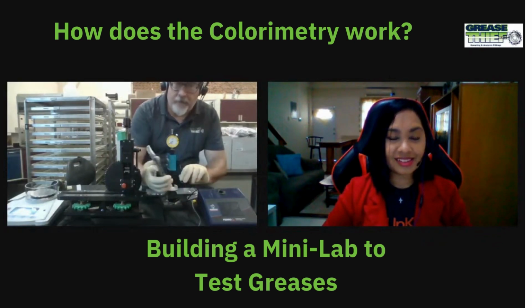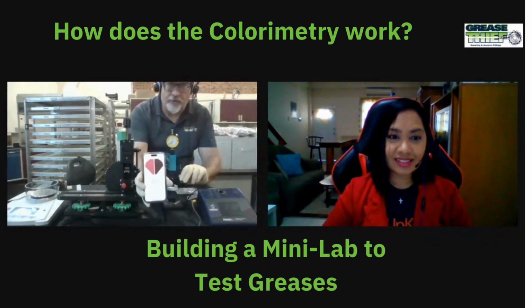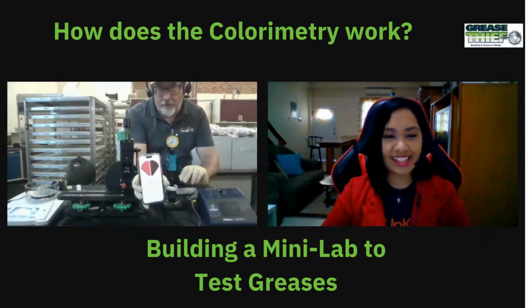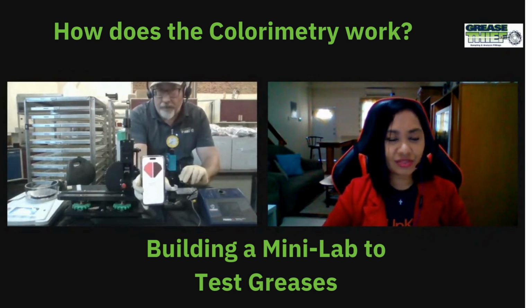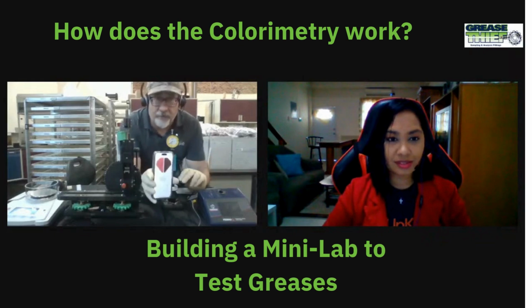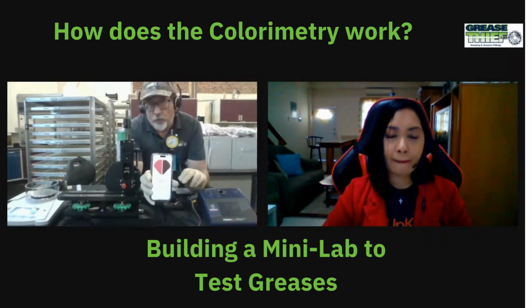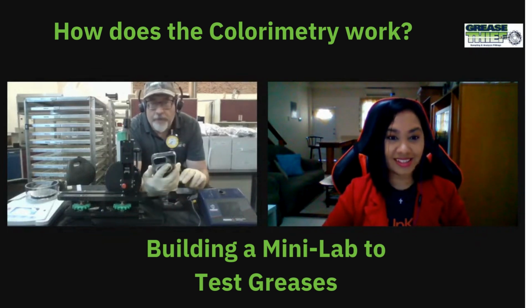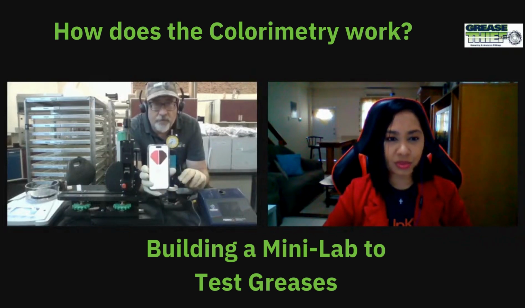Now, what you have is the new grease there on I guess that's our left, and then the sample on the right. And it's pretty obvious the difference there, right? We can see that visually. And this is something that can be helpful putting into a report or emailing a screenshot of this to somebody saying, whoa, we've got unexpected changes here. And right below it, there's delta values. So the delta E for this is 28.7. Oh boy.